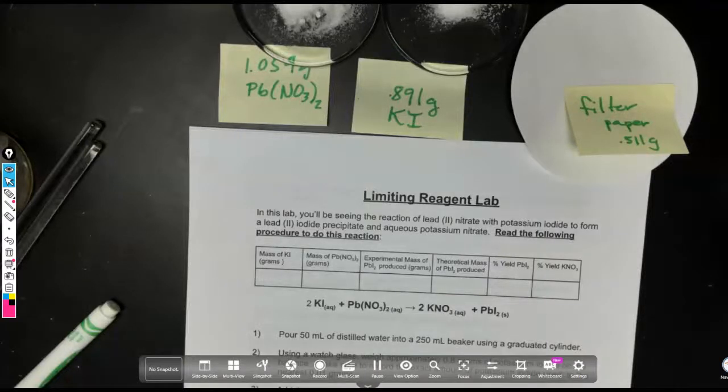So hi everybody, today we're going to do the limiting reagent laboratory, and we're going to be using the chemical reaction of potassium iodide mixed with lead II nitrate to form potassium nitrate and lead II iodide, which is a solid precipitate. And we're going to be collecting that precipitate to measure our product so that we can see an actual versus a theoretical and calculate the percent yield, both in the PbI2 and in the KNO3.